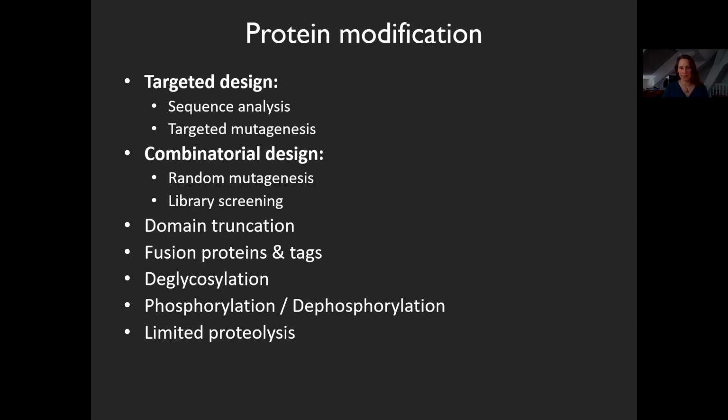So during my PhD, I had a protein which would not crystallize for 2 years. It had been successfully deglycosylated, or so we think, but it never would grow. However, I had several plates in which there was mold. And after 5 months, in one of these moldy plates, where I could see beautiful black strands of mold in my drops, there were crystals.